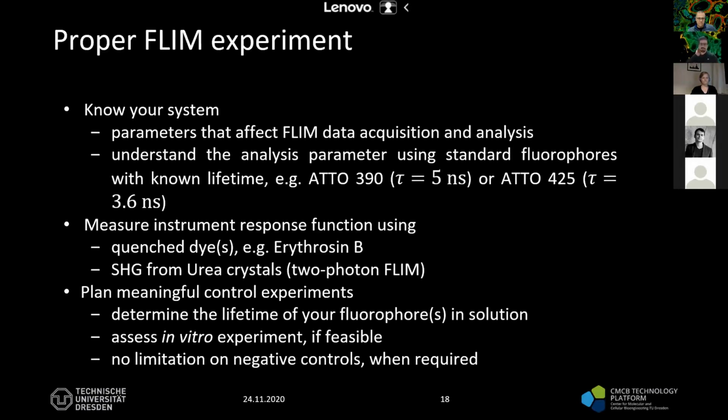Thank you, Amazi. Yes, that's exactly the point. We are all measuring the data with one system, and that's one of the limitations I would call on FLIM microscopy: we are limited to correlative analysis and experiments. So we need to find out what conditions we have with our system and in our lab, with our experimental design, and then keep it consistent through the experiments that we do.